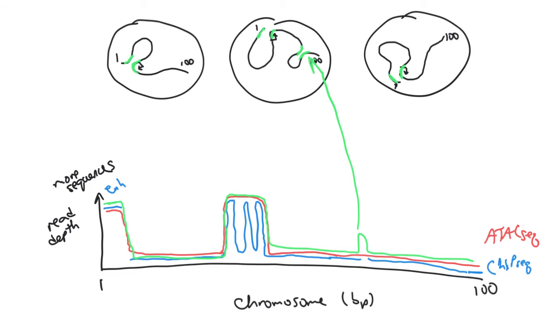So overall then, these three different methods are sort of frequency-based look at which regions of a chromosome are in euchromatin, that's ChIP-seq and ATAC-seq, or are physically close to each other in three-dimensional space, and that's 4C-seq. So there are different ways to answer the question of what regions of the chromosome are in euchromatin and physically close to each other, and those tell us most likely where enhancers are located.